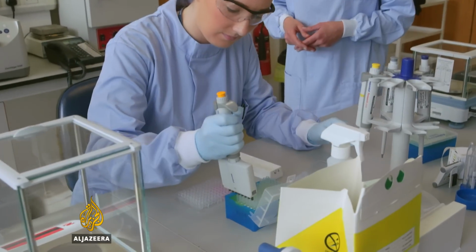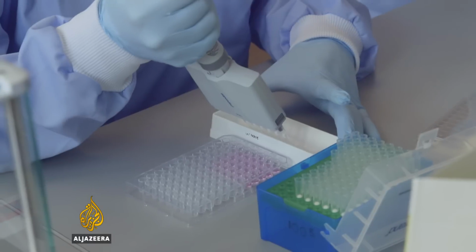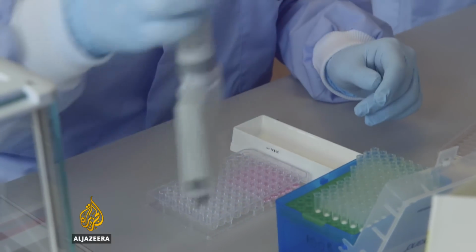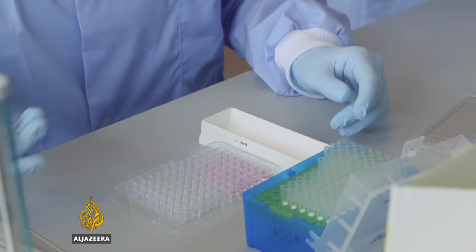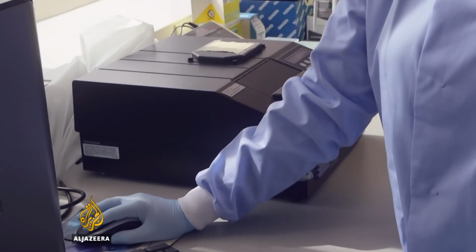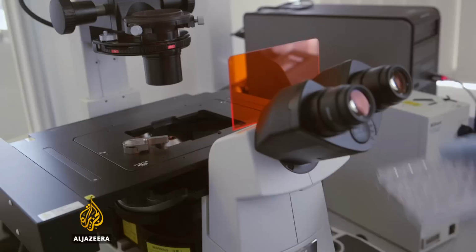After introducing a drug to the liver chip, the team can study the impact it has by performing the lab equivalent of a biopsy or a blood test. This allows them to test whether the drug is toxic or to see how successful the drug might be at treating disease. Reducing the dependency on animal testing enables Emma and her team to run a huge number of tests, gathering large quantities of data much more quickly before clinical trials begin.